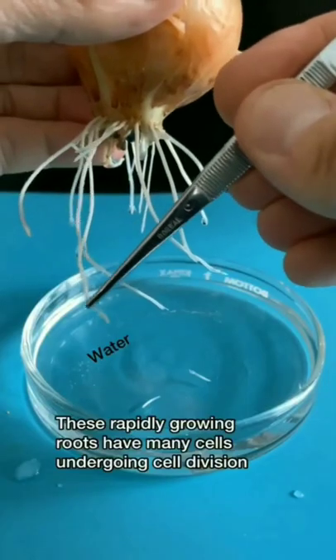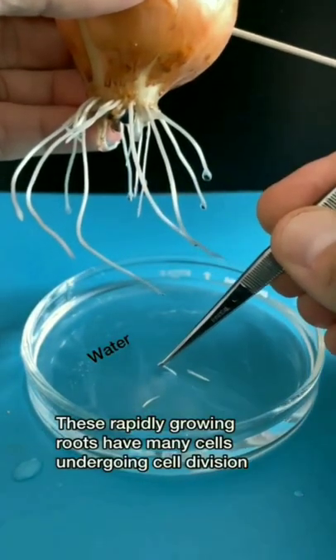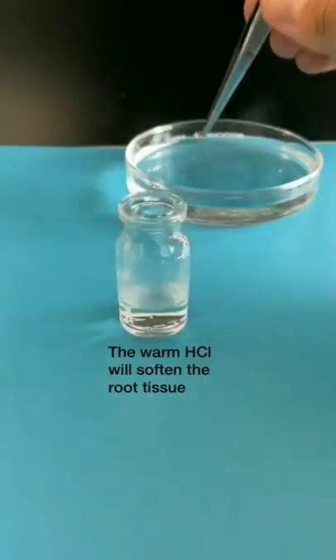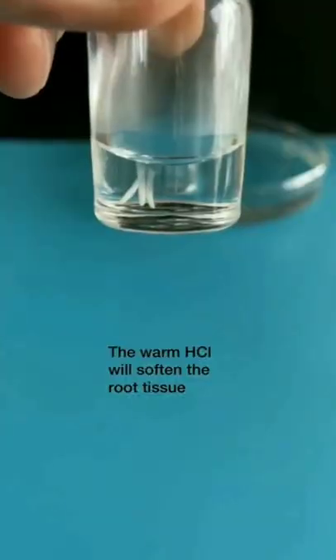Seeing chromosomes under the microscope. These rapidly growing roots have many cells under cell division. Warming a molarity of HCL solution will soften the root tissue.